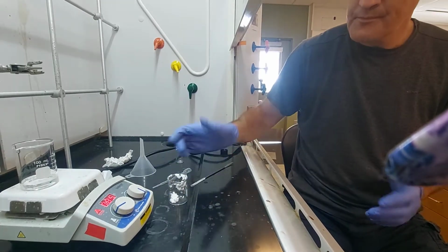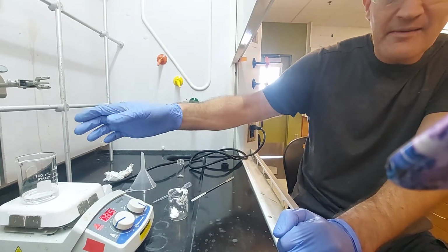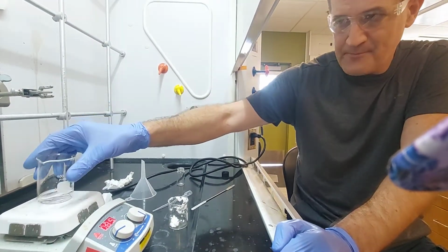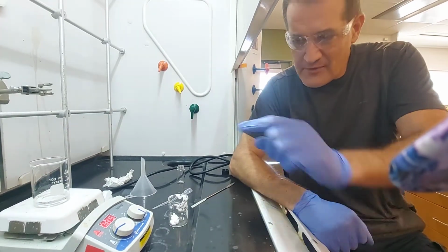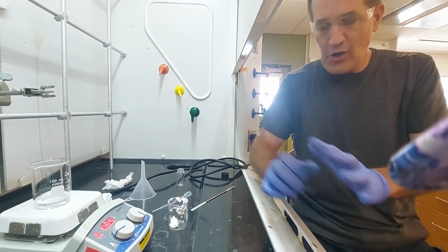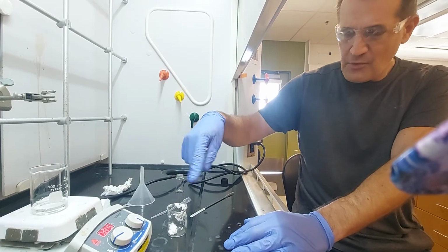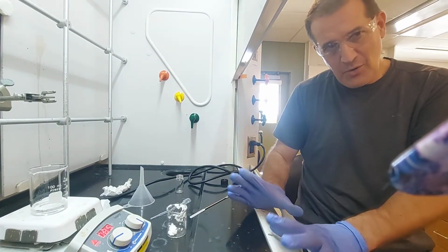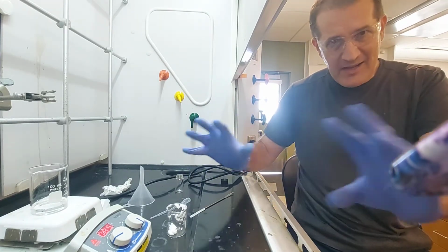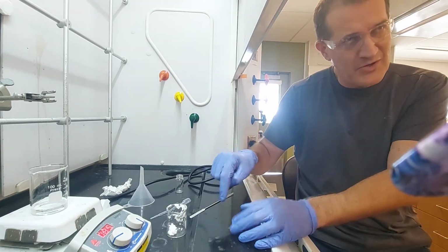Now, what we're going to be doing to recrystallize this is using some ethanol. And we have some hot ethanol here that's been sitting on the hot plate. You want to make sure that the solvent you add in here to recrystallize is hot. The whole point of recrystallization is that your product will dissolve when it's hot, and then as it cools, the product that you want, which is present in the largest amount, comes out of solution, and the impurities that are present in a much smaller amount stay in solution. You can filter those off.